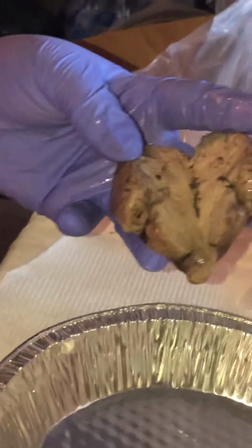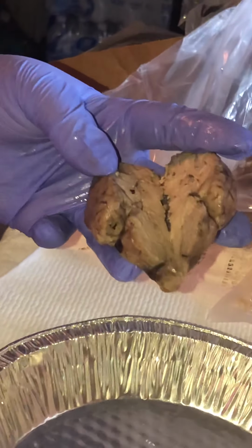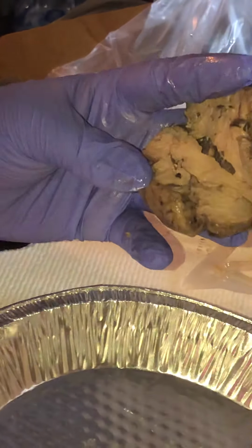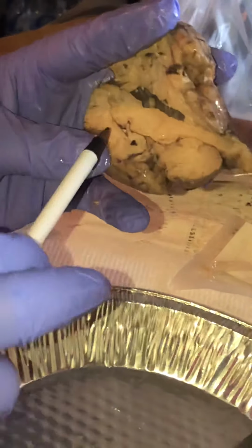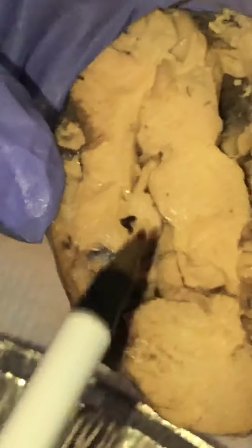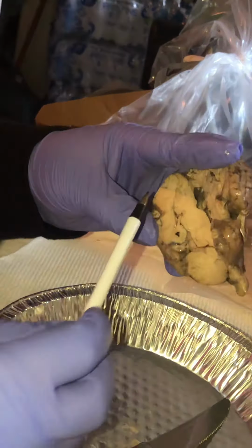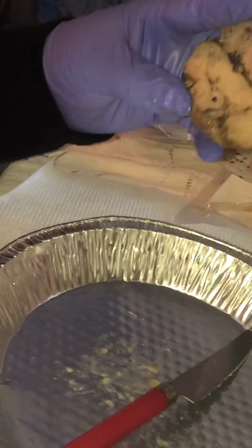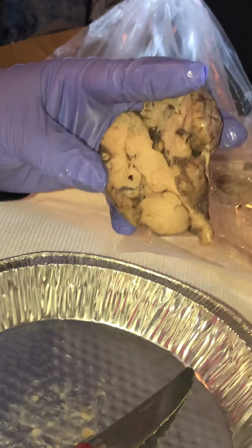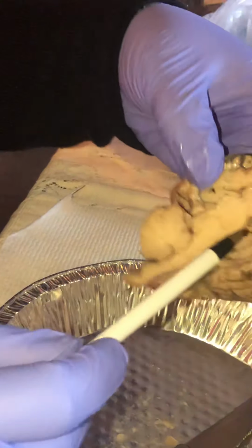So next we're going to do, let's get into these. So we have the corpus callosum right here. Okay. And then we have the thalamus, which is right by the corpus callosum.